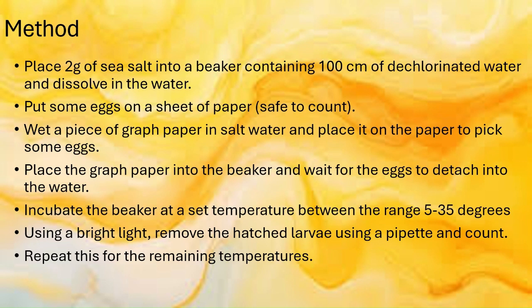Incubate the beaker at a set temperature between the temperature range of 5 to 35 degrees, and using a bright light, remove the hatched larvae using a pipette and count. Repeat this for the remaining temperatures.